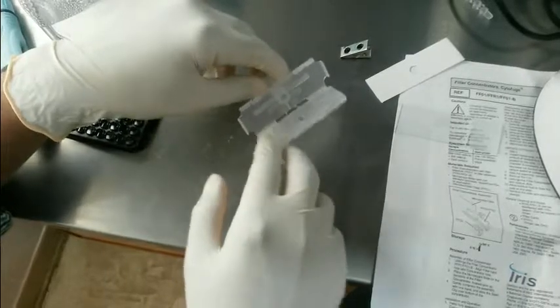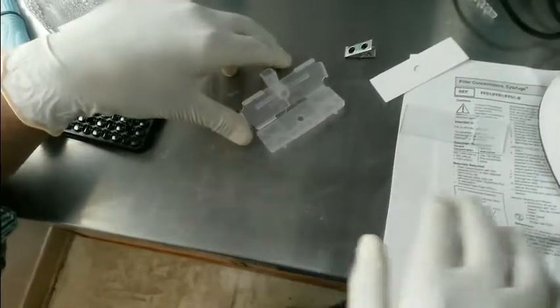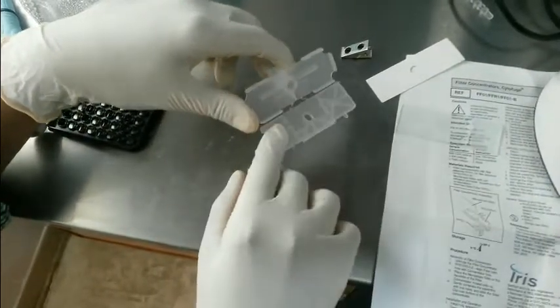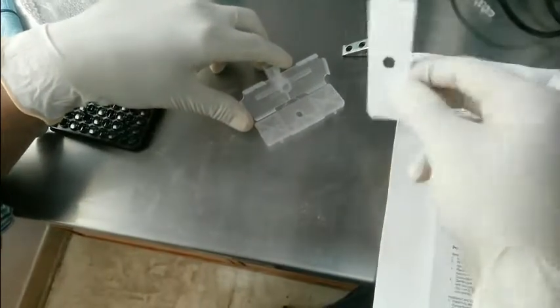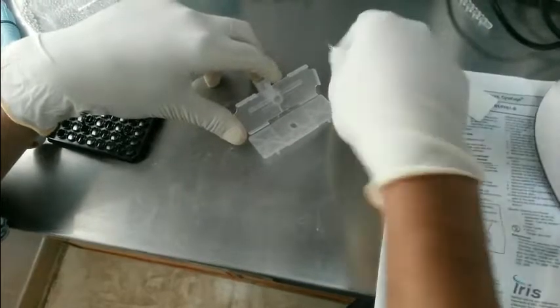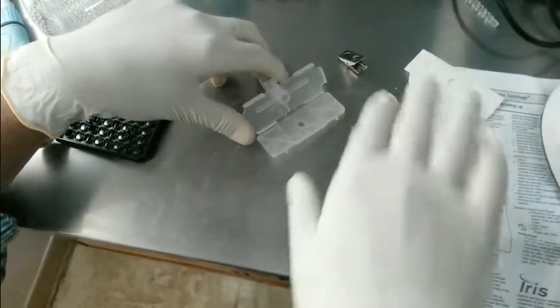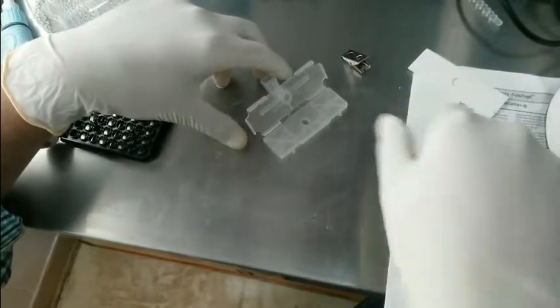Now we are making a slide for the Cytofuge 2. Here we have a filter concentrator, here we have a filter paper, this is the glass slide and this is the metallic clip which is provided with the system.